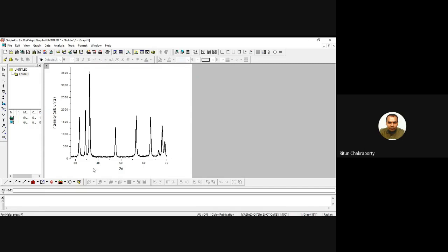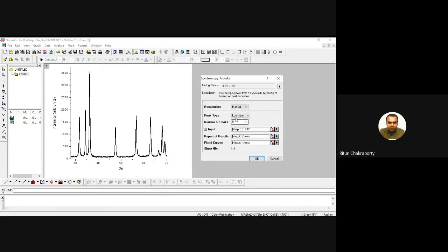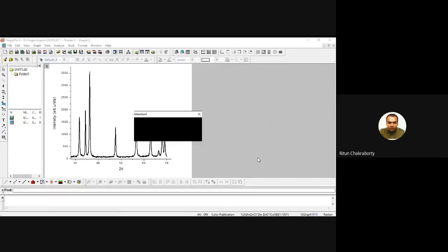Now we will do multiple peak fitting. There are nine peaks — one, two, three, four, five, six, seven, one small peak here, eight, nine. To fit all nine peaks, go to Analysis, then 'Fit Multiple Peaks'. By default it is set to Lorentzian fitting. We choose Lorentzian and set the number of peaks to nine, then click OK.